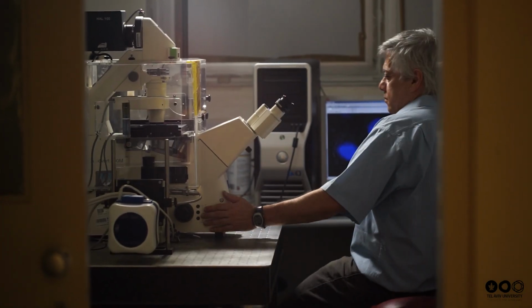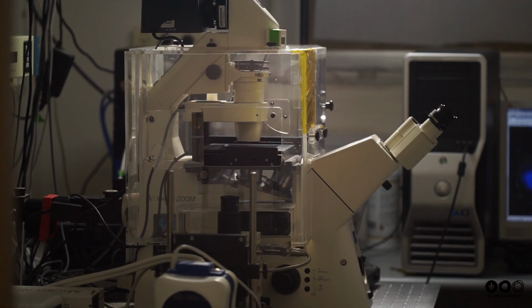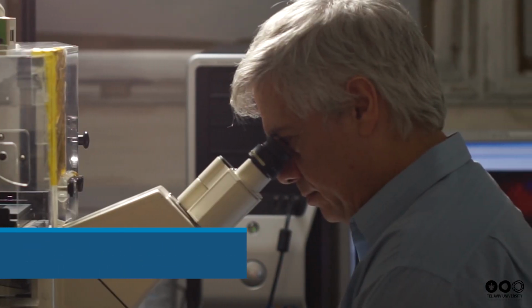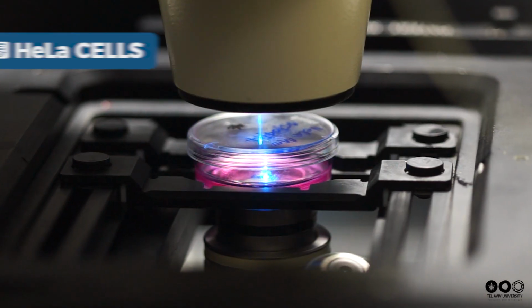I've asked Professor Marcelo Ehrlich to show us some cells under his microscope. My name is Marcelo Ehrlich, and this is an immunofluorescence microscope. Today, we are going to use this microscope to observe live HeLa cells, which are human cervical carcinoma cells, at very high resolution.